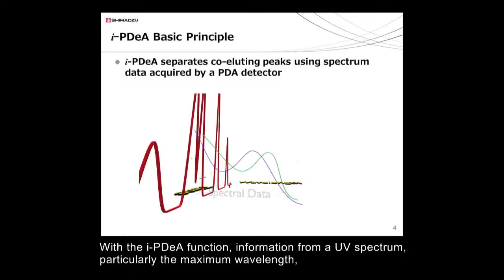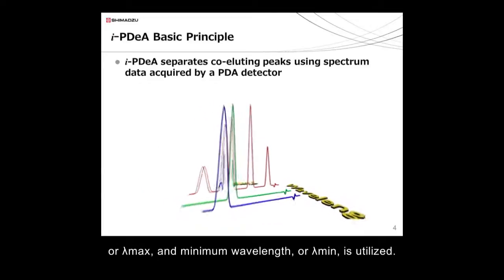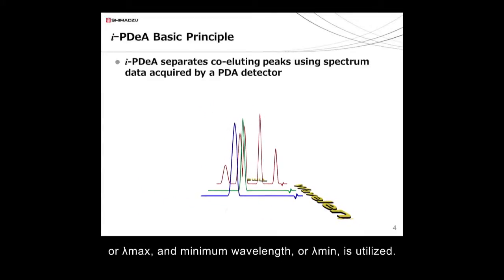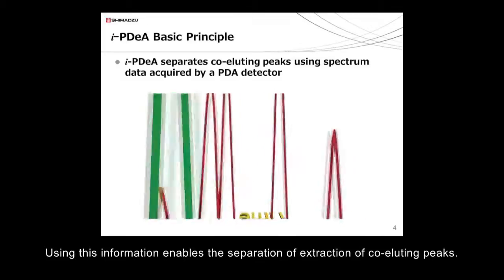With the IPDA function, information from a UV spectrum, particularly the maximum wavelength or lambda maximum, and minimum wavelength or lambda minimum, are utilized. Using this information enables the separation or extraction of coeluting peaks.